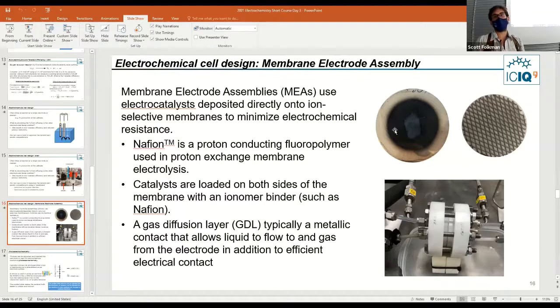And so maybe you get a detector or an analytical technique to look for hydrogen peroxide. Or maybe your electrochemical cell is leaking out gas. That's a really tricky problem if you're involved in a gas like hydrogen or oxygen, or if you're doing CO2 reduction, keeping track of all the CO2 you put in is going to be hard. But maybe keeping track of your products might be a little bit easier, but maybe you're making carbon monoxide from that process and that's escaping too. So it can be tricky.